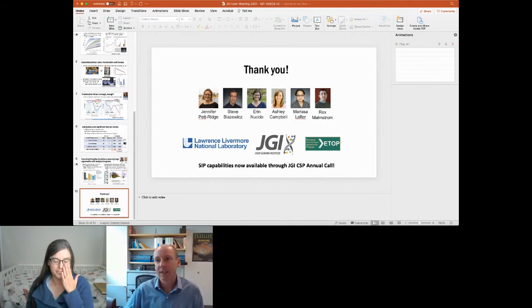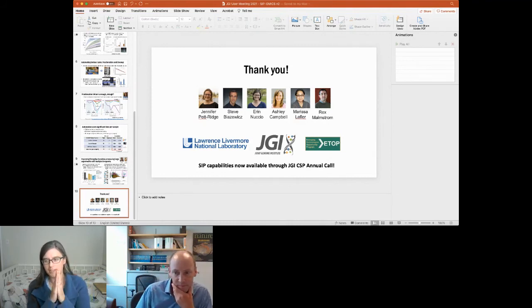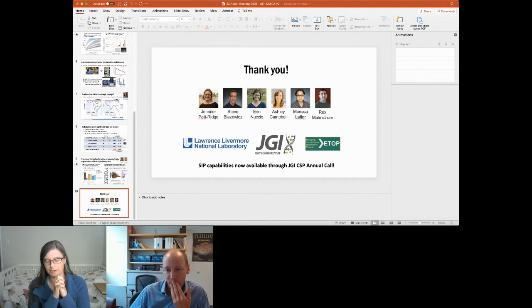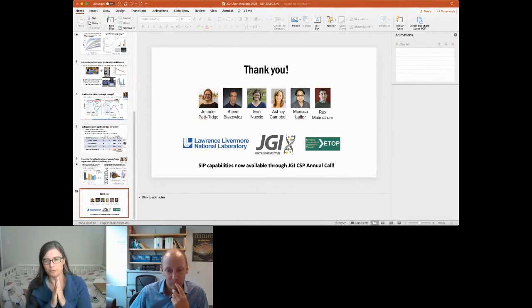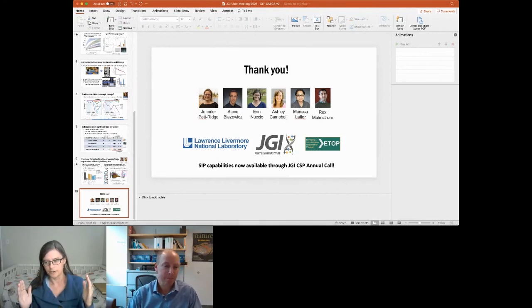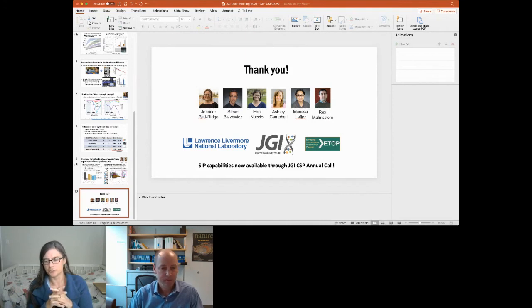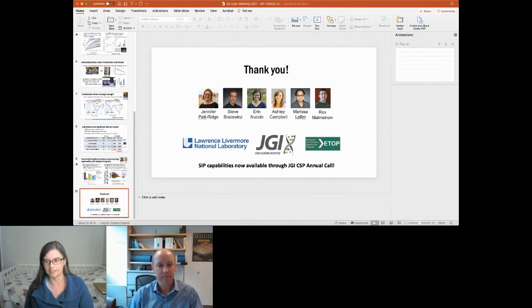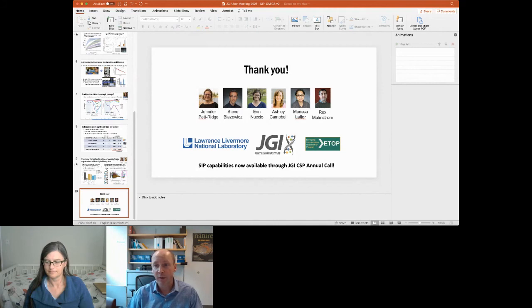That's a good question. What's really cool about SIP is that you've taken a community and split it into different fractions. In a bulk sample you might have one set of abundant organisms, but across ten fractions, each fraction has a different set of abundant organisms. We found that when we co-assemble across an entire gradient, we actually produce more MAGs than if we had tried to assemble from bulk soil alone — it's a nifty way to spread out the sequencing of a community.